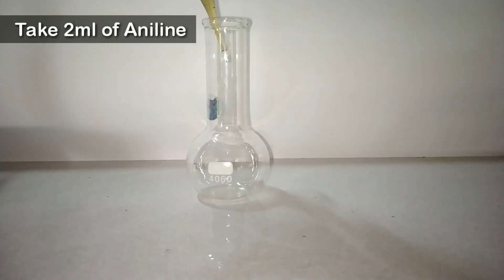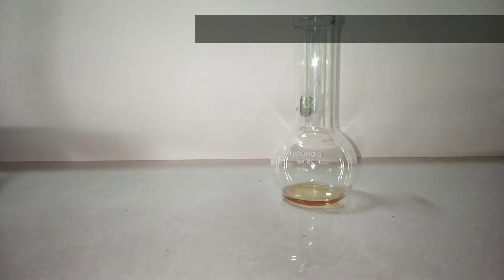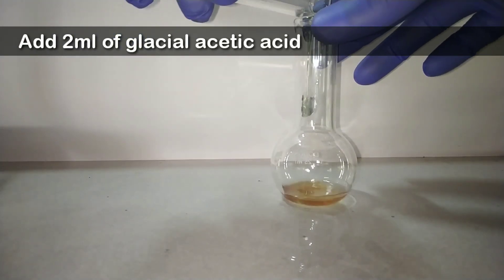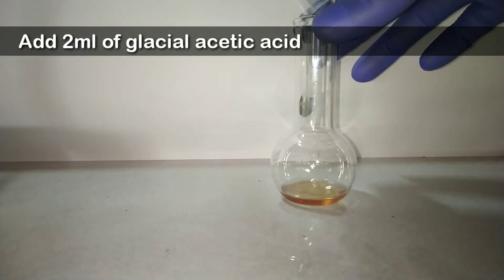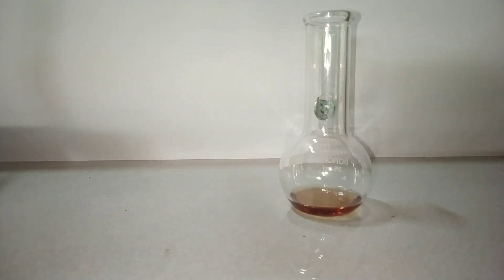Procedure: first of all we take 2 ml of aniline in this flat bottom flask. Into that we will add 2 ml of glacial acetic acid. We should be very careful while handling aniline as it is toxic.